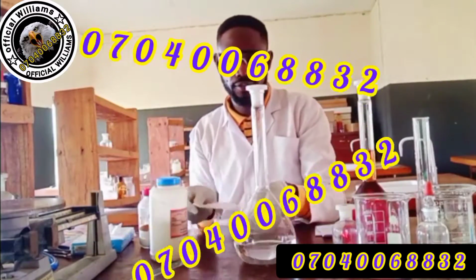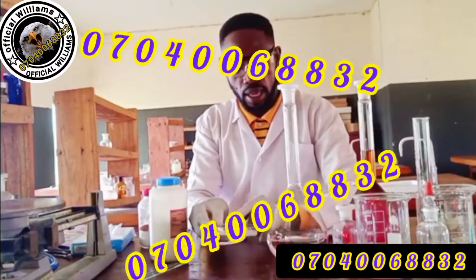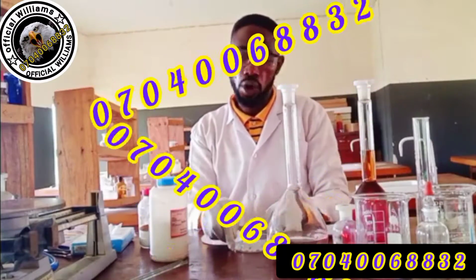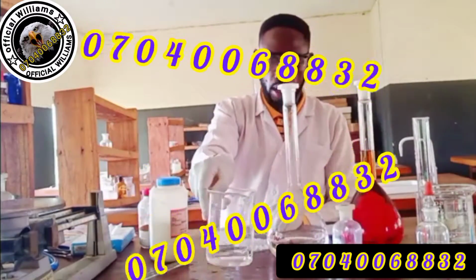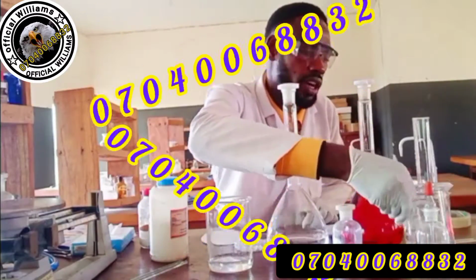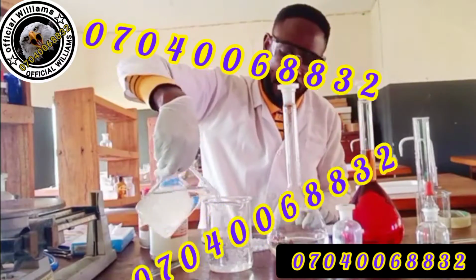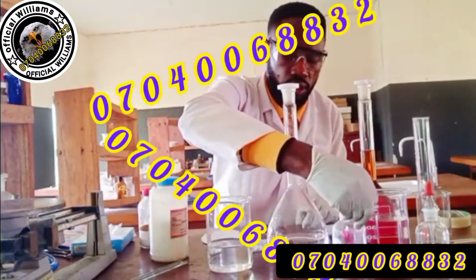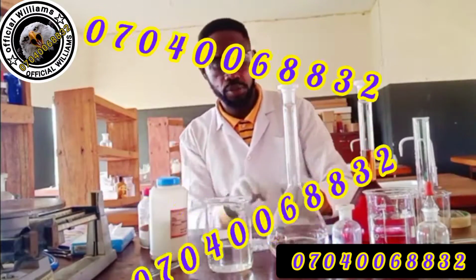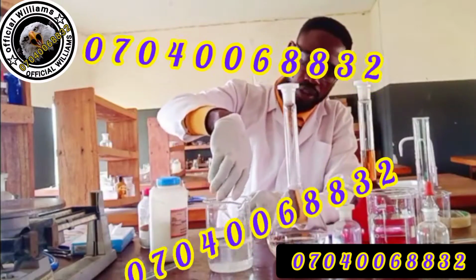So over here I have the exact mass specified. I'll dissolve it here. If I want, you can also dissolve in a small amount of water like this. Remember, don't dissolve to such an amount that will exceed, let's say 500 in the beginning, so that it can make up very well. So using your discretion, when you look at this volume here and this volume here, they cannot reach this place. So what I do is I will add this to this for the crystals.